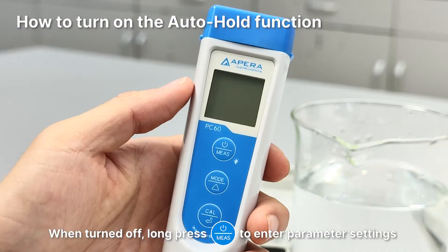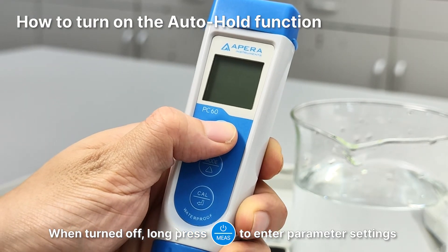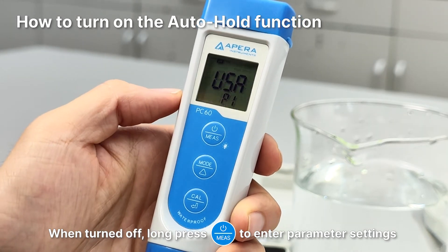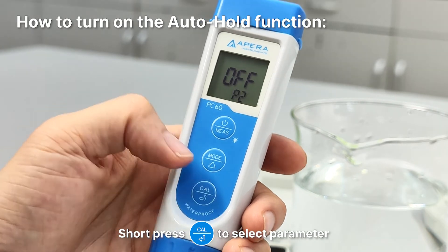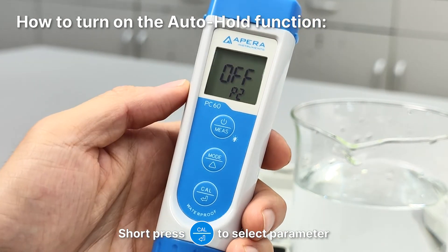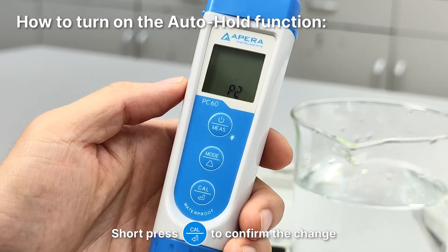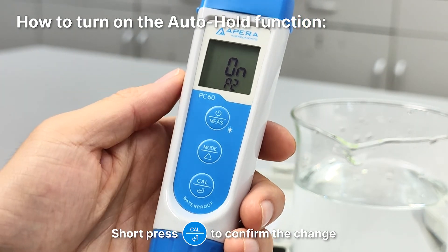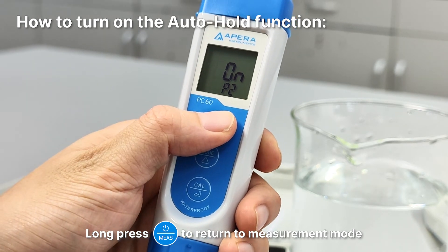How to set up the auto hold function: When turned off, long press the power button to enter parameter settings. Short press mode to switch to P2. Short press Enter to select the parameter. Short press mode to change the parameter to on. Short press Enter to confirm the change, then long press power to return to measurement mode.